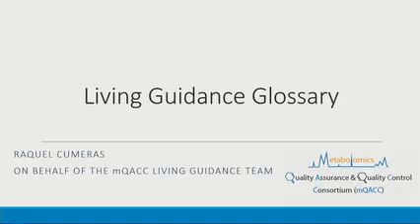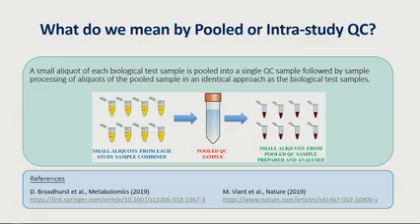So now I'm going to introduce you to the Living Guidance Glossary. Those are a set of definitions. So, what do we mean by pool or intra-study QC? It's a small aliquot of each biological test sample, which is pooled into a single QC. Then this QC is aliquoted and prepared in an identical approach to the biological test samples.